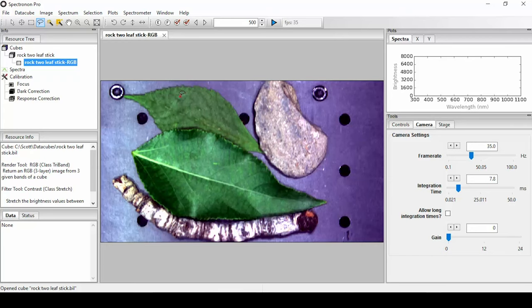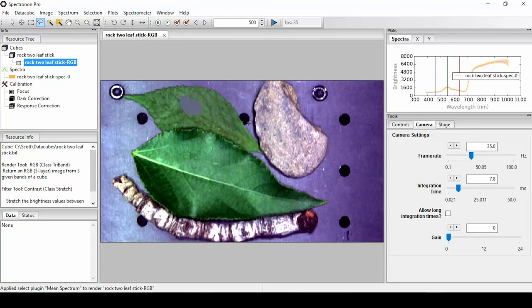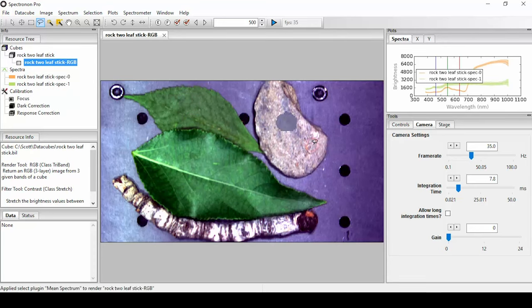The system comes with data acquisition software. This software also has many tools for data analysis and visualization of hyperspectral data.